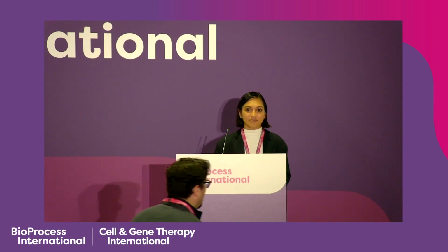I do have a curiosity. So the protein L mimetic ligand is a triazine scaffold? Yes. If I caught you correctly, after elution, there was a significant quantity of Fab that was found in the stripping, in the resin regeneration. And they both seemed to have comparable purity. Now, I can see how two potential proteoforms of Fab would come out at different times on an elution gradient in an ion exchange, but in an affinity setting, I was wondering whether you know what causes so much Fab to bind so strongly and be present in the resin strip.